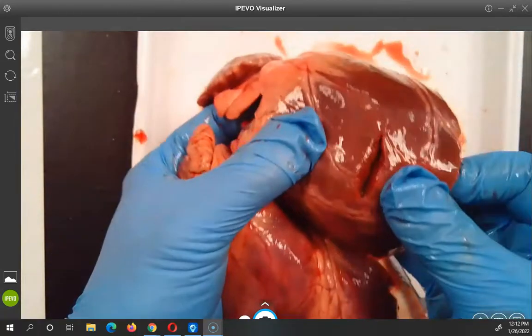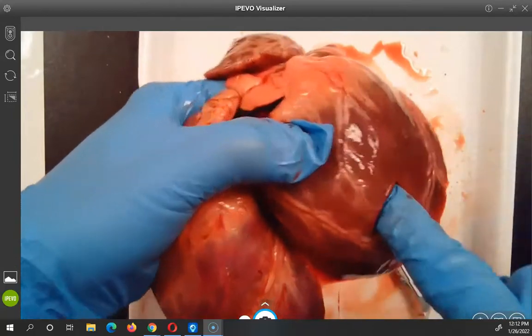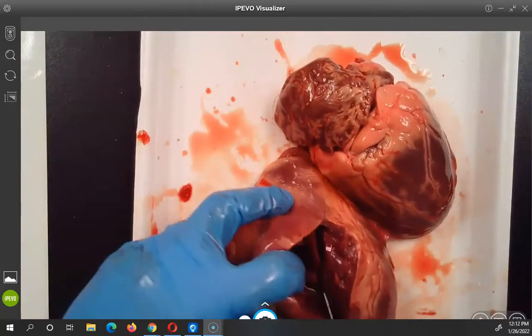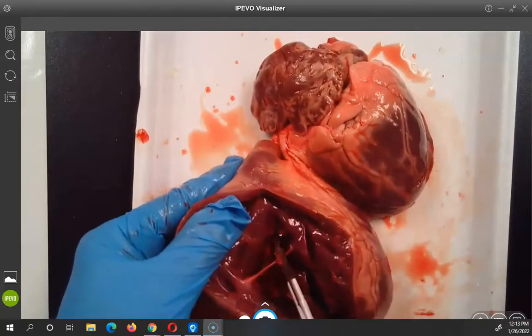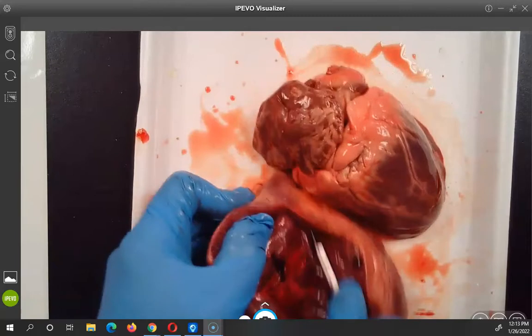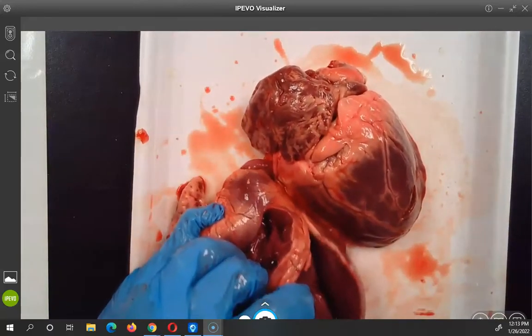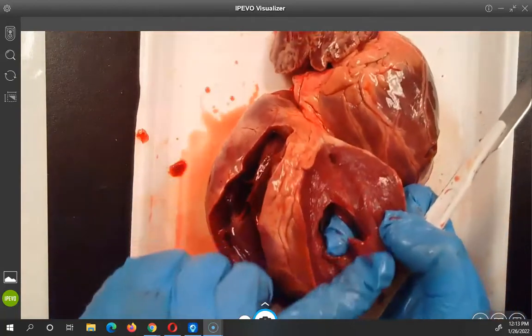Oh look, I made a mouth — hello, I'm a pig heart! Oh, he's got a mouth. Look at the inside of here — let's cut through this one. Oh look at that, that's cool. See, look at that — look how lean that is. Pretty nice looking muscle there.